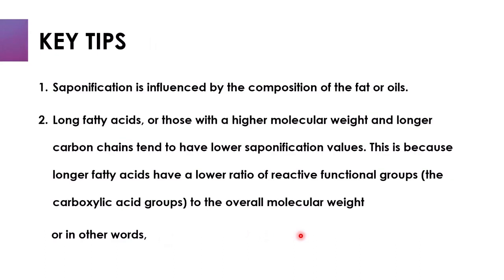Let's look at some key tips. First of all, what we have to notice is that saponification is influenced by the composition of the fat or oil. And second, long fatty acids, or those with a higher molecular weight and longer carbon chains, tend to have lower saponification values. This is because longer fatty acids have a lower ratio of reactive functional groups, that's the carboxylic acid group, to the overall molecular weight.